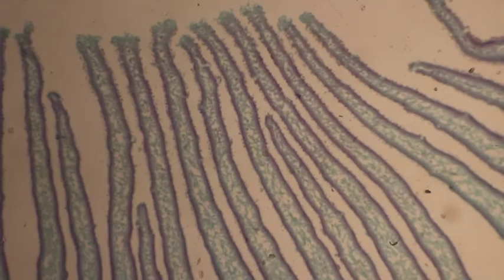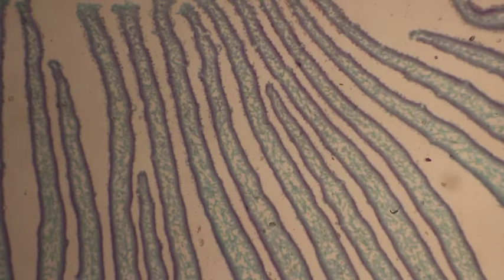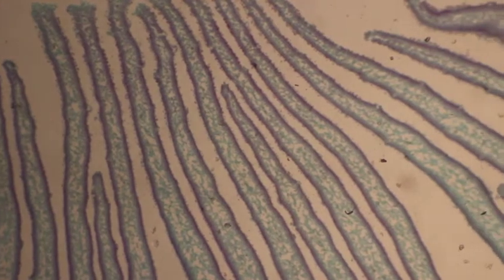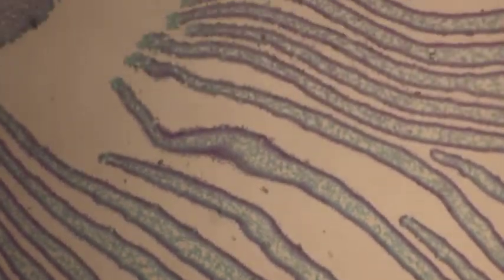Here are the gills under the 4x objective — so 40x magnification. I'm going to look around a little bit on these gills because I want ones that have a lot of spores.